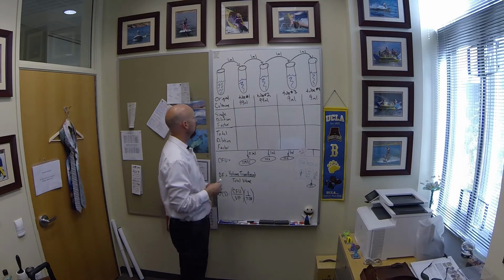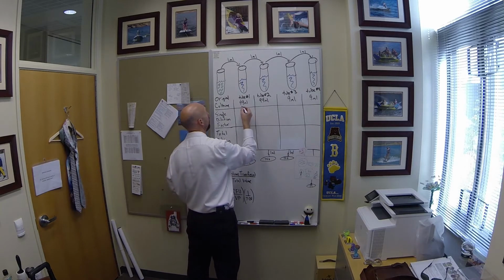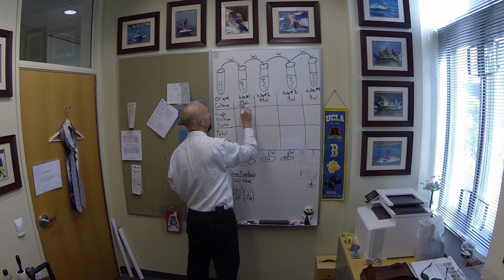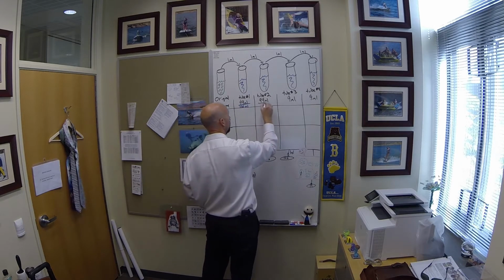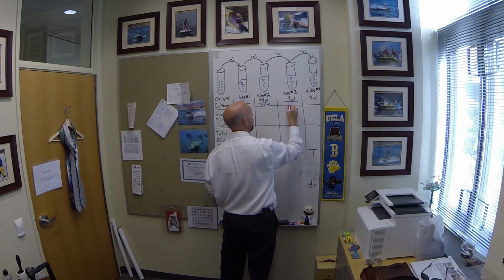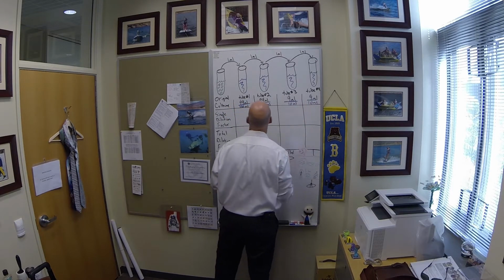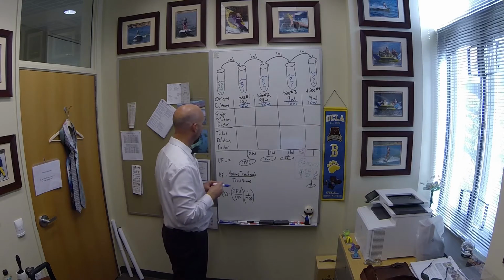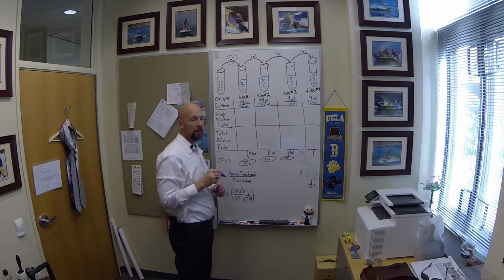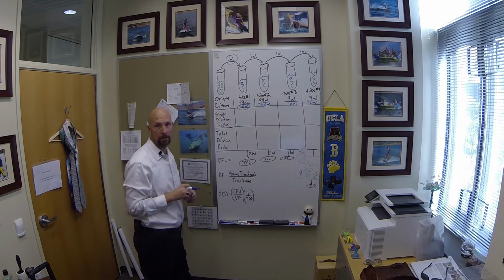So the final volume in tube number 1 after we do the transfer is going to be 1 plus 99 is 100 mils. This is going to be 100 mils. This tube's going to have 10 mils, and this tube's going to have 10 mils. So we need to know what the important numbers are: the volume transferred, and the total volume after transfer in each tube.